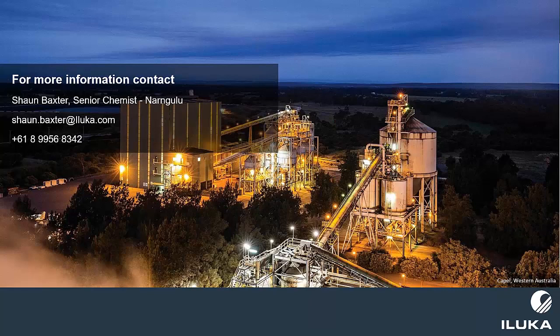So, just a question from the floor about the centralised structure of CCLAS at Iluka. Yeah, so the structure that we went with, we operate CCLAS via a remote desktop, and it's a dual server setup, so we've got shared loading so that we try and split the loading over 2 servers from the different labs. We've probably only had a handful of outages in that time where we've lost network connection to Perth.